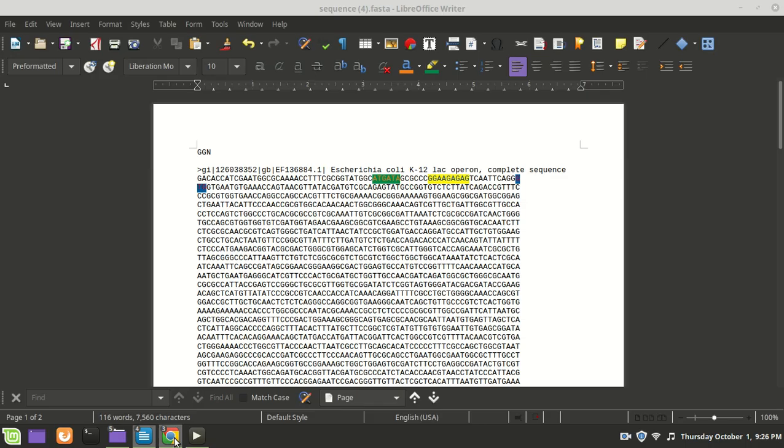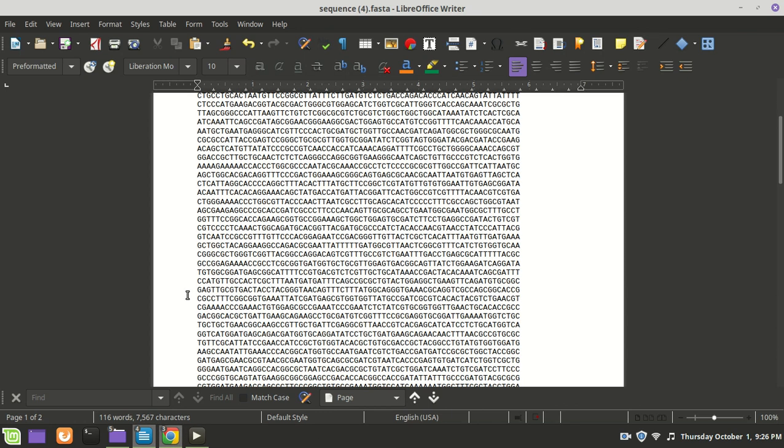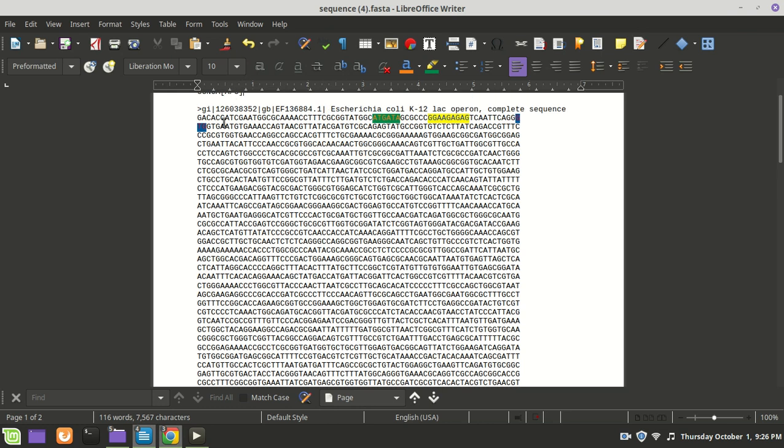CA, then an A or a G. So this is what we're looking for, and of course I probably lost my place again.